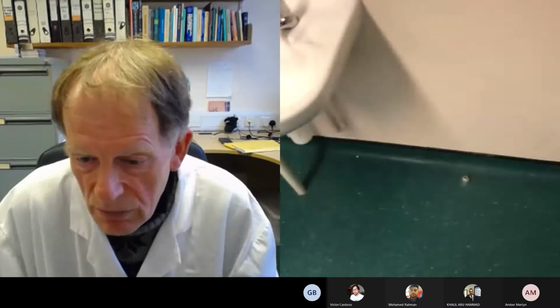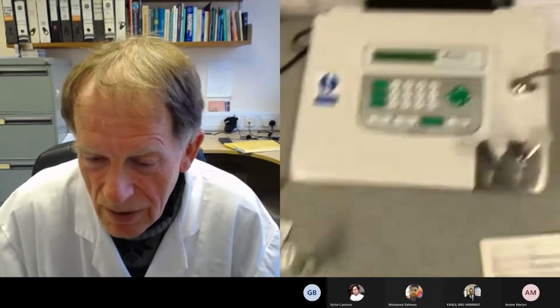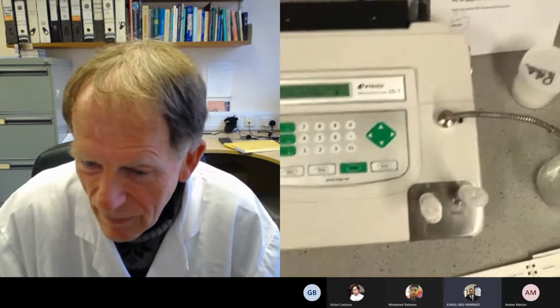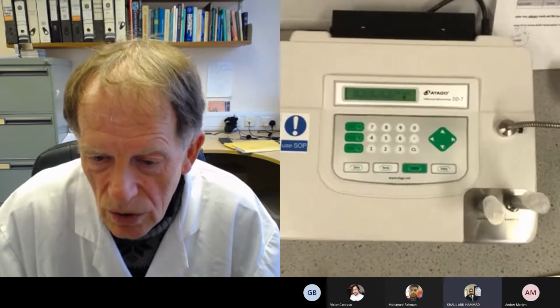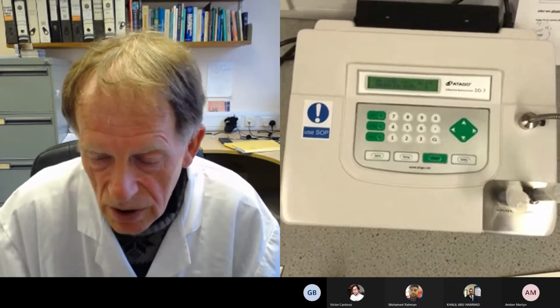Why would we want to use a refractometer for measuring concentration? What's the big advantage of a refractometer for measuring concentration compared to a spectrophotometer? Maybe it might be used to measure the viscous solutions. Well, we can measure viscous concentrated solutions. That's correct.